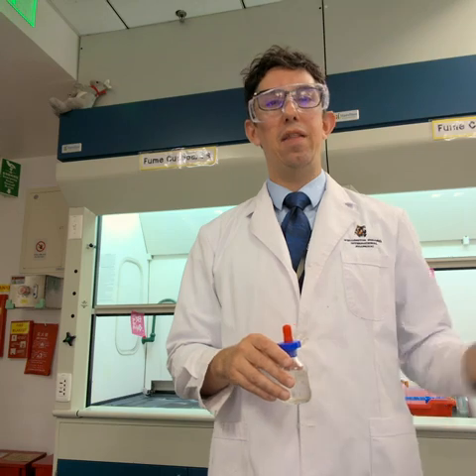Okay, so in this one we're going to do the tests for the halides. So the halides are the negative versions of the halogens. So we're going to test for chloride, bromide, and iodide.